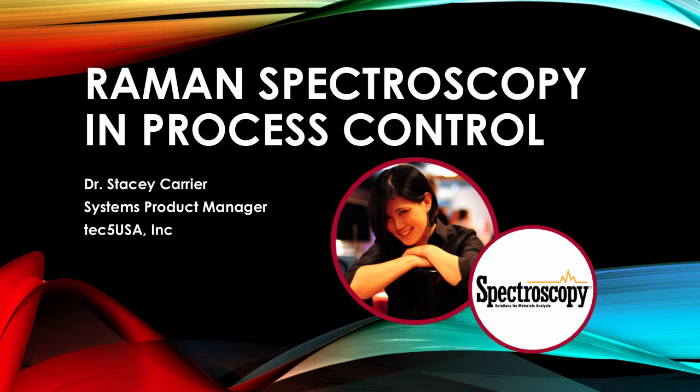the number of applications is huge. It's ginormous. And there's just a few. First of all, like in semicon, Raman can actually be used to measure the crystallinity of silicon or other semiconductor materials, but you can also tell the amount of stress and strain in these crystals, which becomes very important because we all want really nice TVs to look at. So the amount of stress and strain and the amount of crystallinity become very important factors.